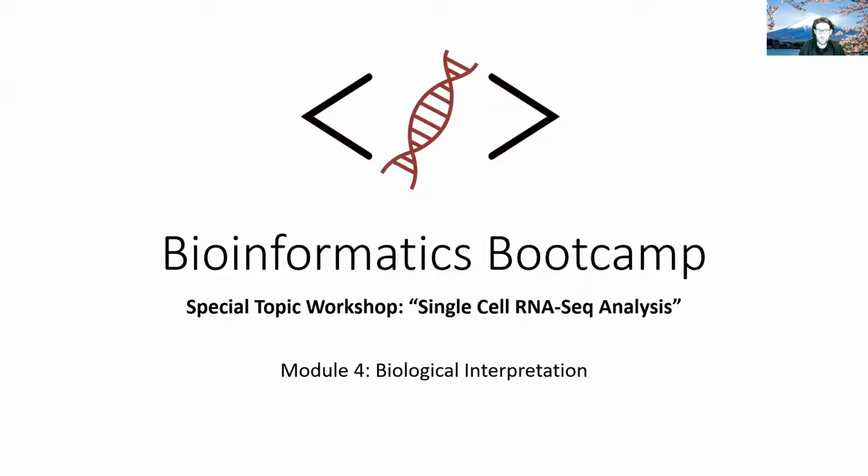But I want to make sure we get through everything, because we're going to be talking about one of the most difficult and important parts of all single cell analysis, which is biological interpretation. And in particular, how do you assign cell types and how do you understand the biological significance of your clusters? It's really how you tie the computational side of things back to the initial biological questions that you had. So it's very important for us to understand how that works.